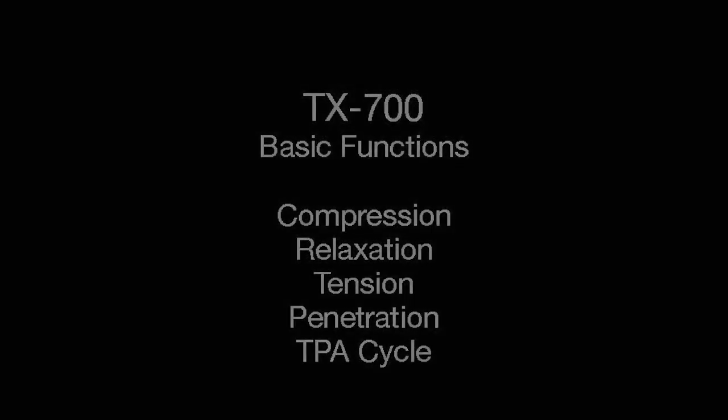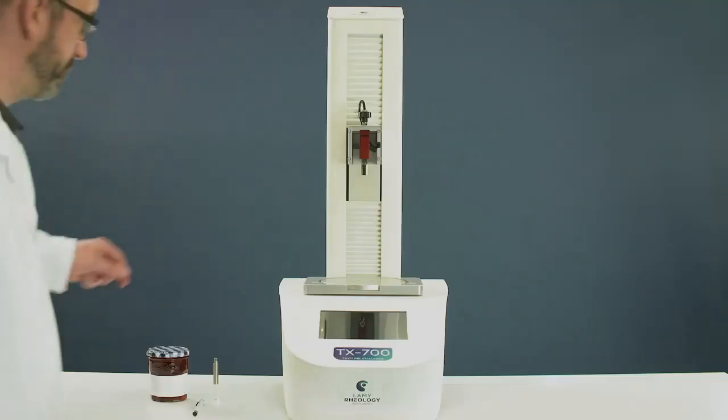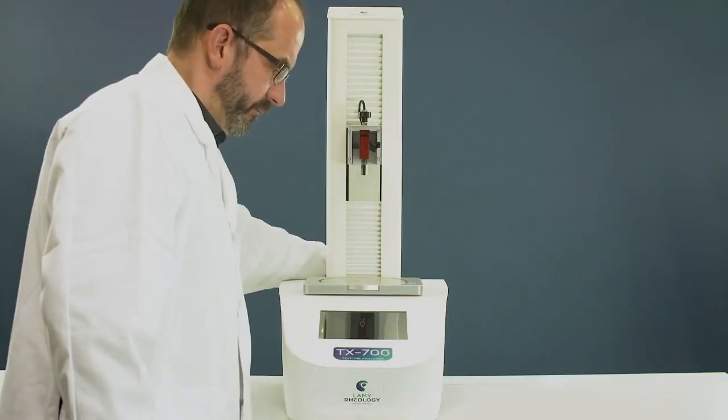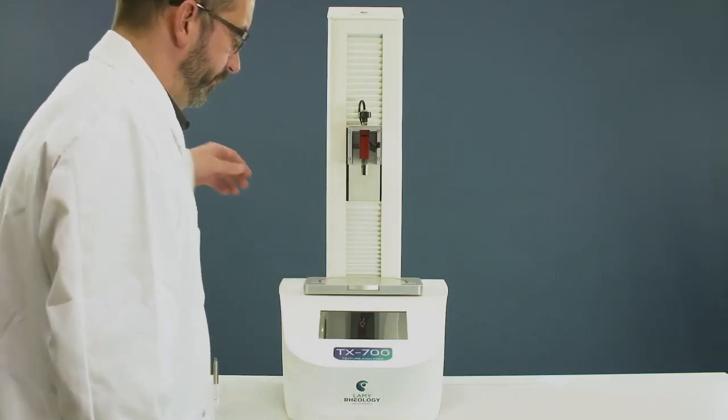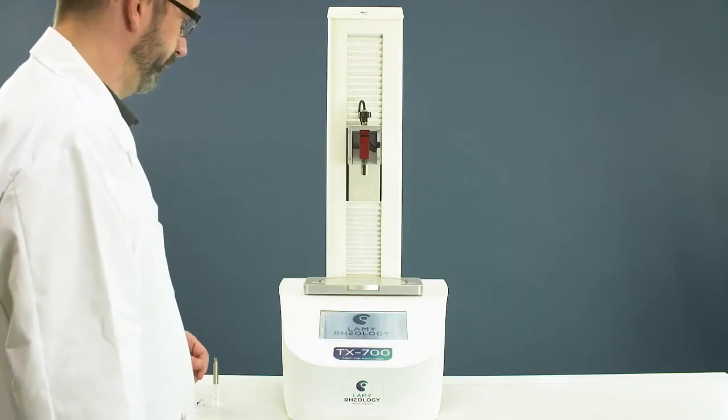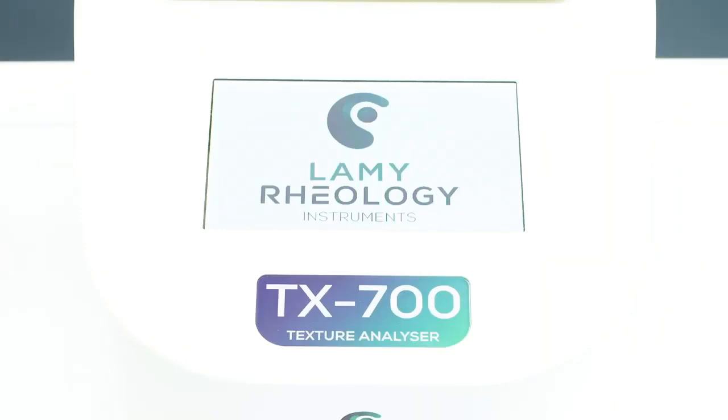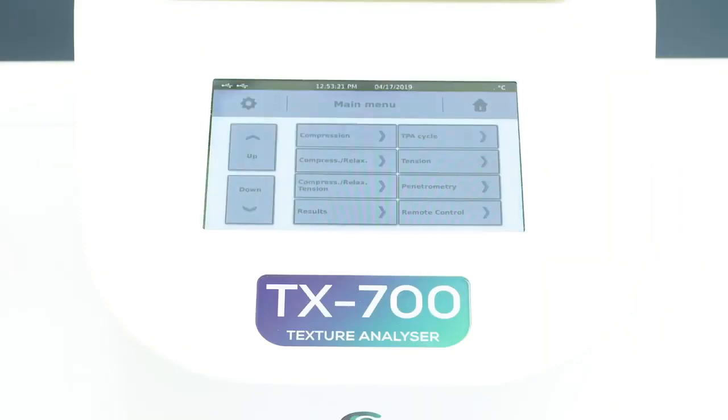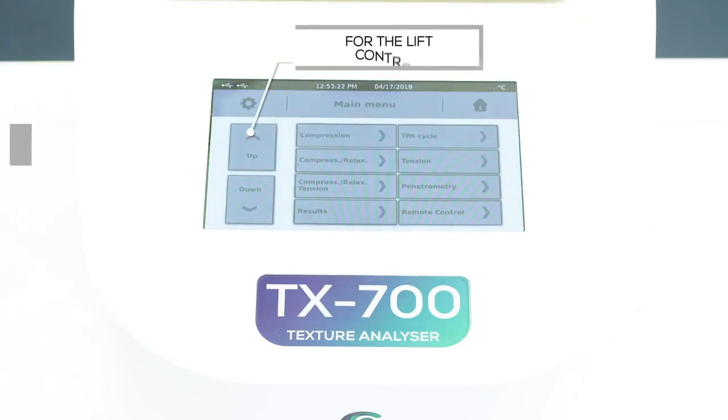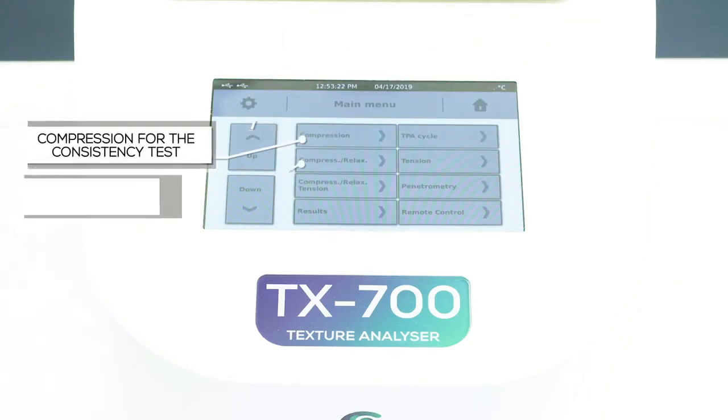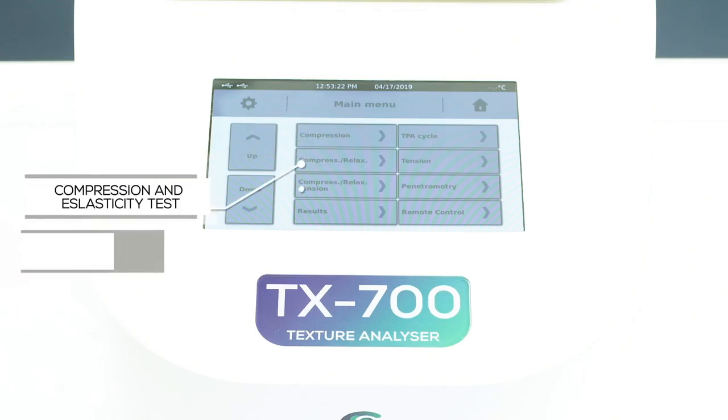The Texture Analyzer. Switch on the Texture Analyzer. Available functions of TX700 without the software control are Lift Control, Compression for the Consistency Test, Compression and Elasticity Test.